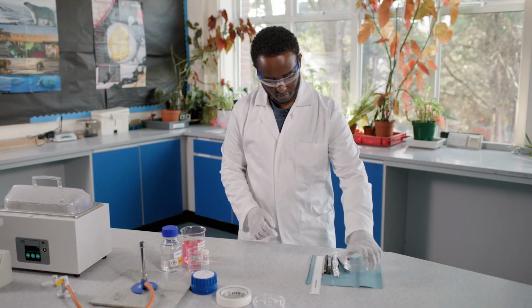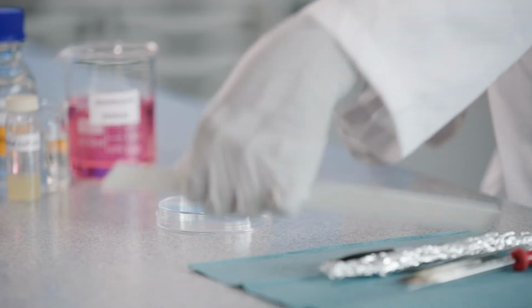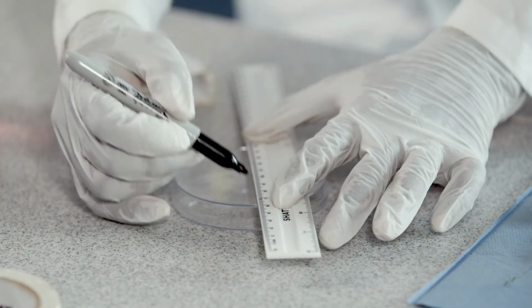I am now going to demonstrate how to successfully pour an agar plate. Keeping the lid on the Petri dish, turn the dish upside down. Use the pen to draw 3 sections on the base.